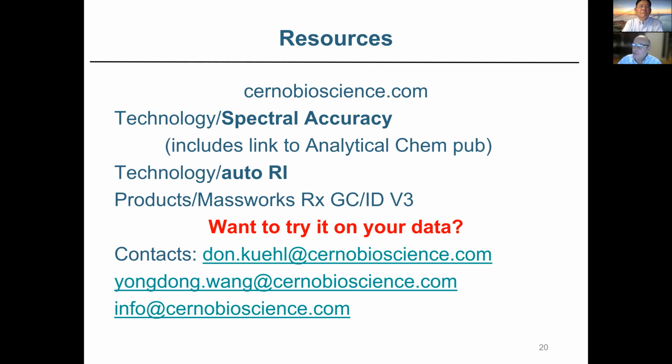As long as you have chromatographic peaks that are spread reasonably well across the run, because if you have a big gap, obviously you can see how these curves work, you're going to have larger errors in retention index. So as long as there's reasonable coverage, you absolutely can use anything you want for a retention index calibration standard. And that's how we do this auto RI. We're actually using identified samples in the run to build the retention index. So no, it doesn't have to be alkanes.